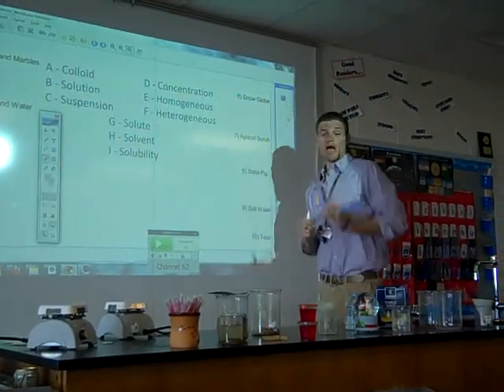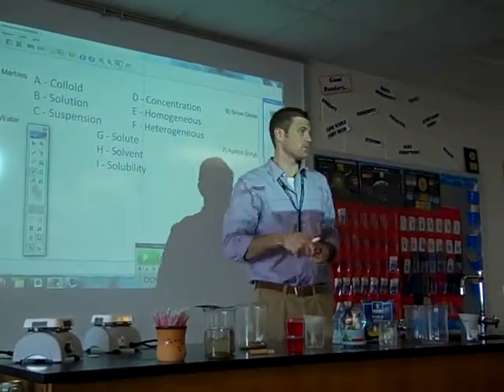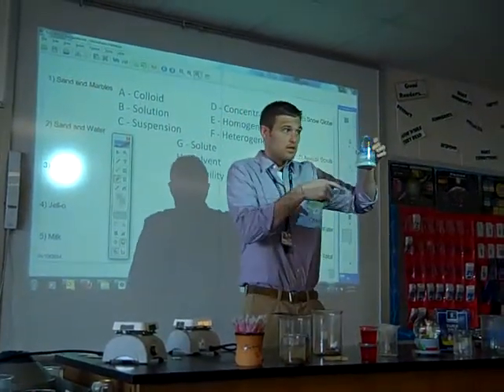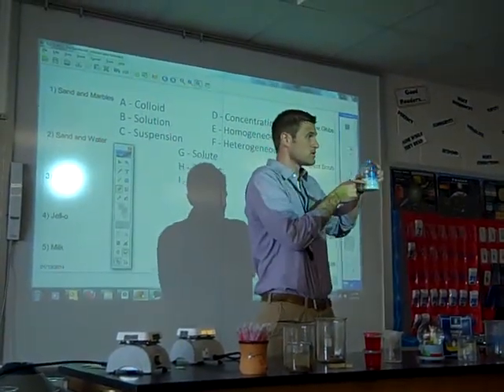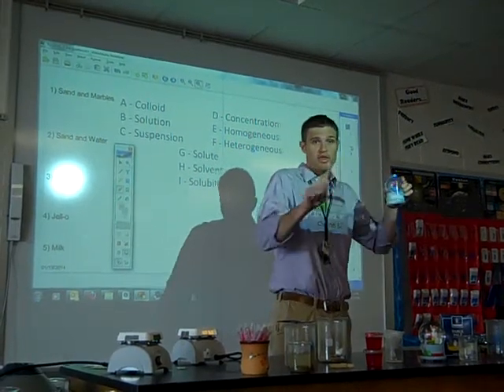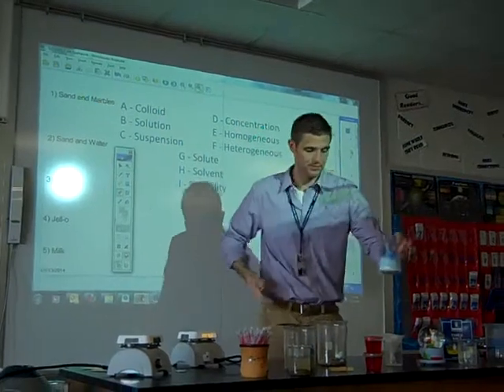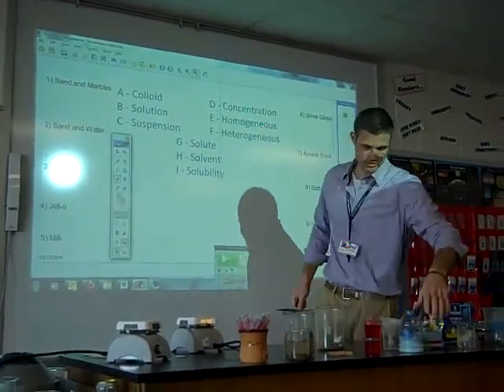Is this homogeneous or heterogeneous? Put the answer in your yes. Is A homogeneous? Does this look like it's one thing? Yes, that's what homogeneous means, right? Homogeneous, one thing. So if it looks like it's one thing, not if it is one thing, but if it looks like it.